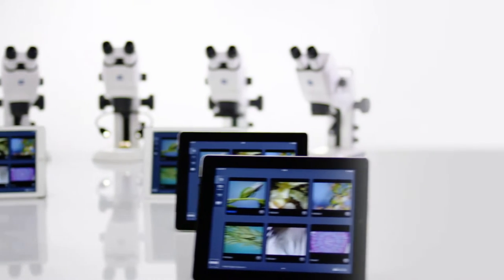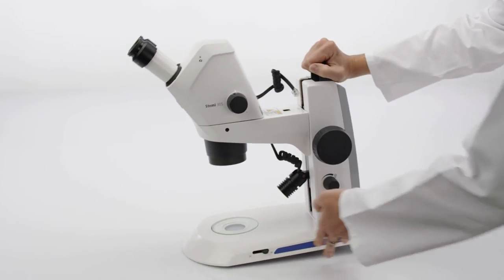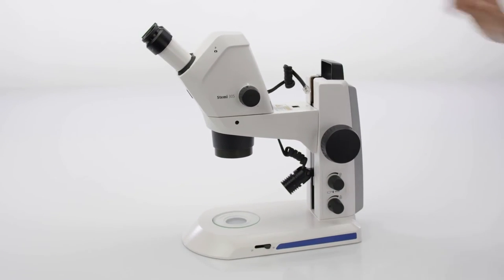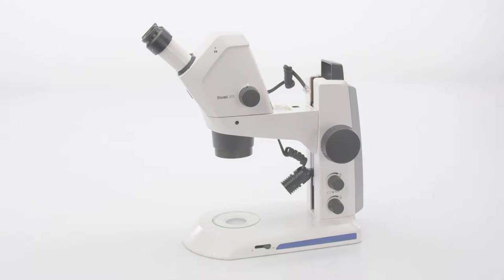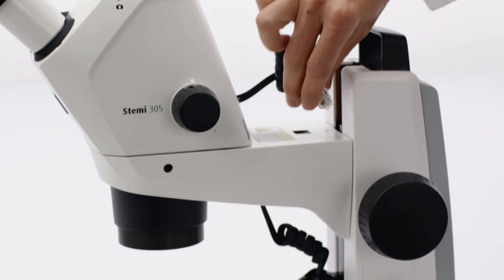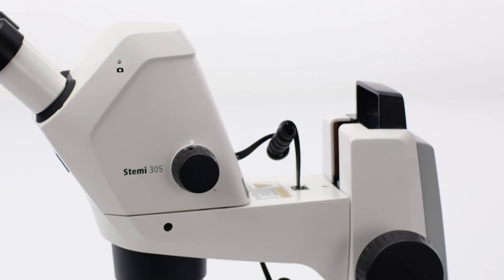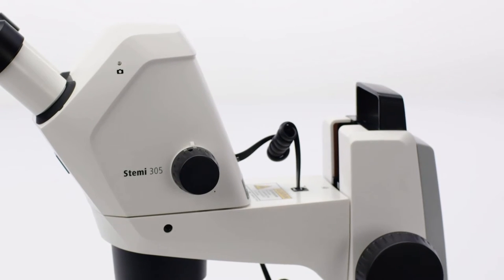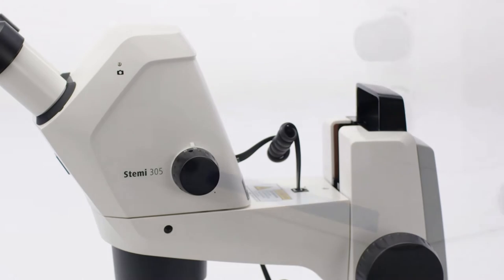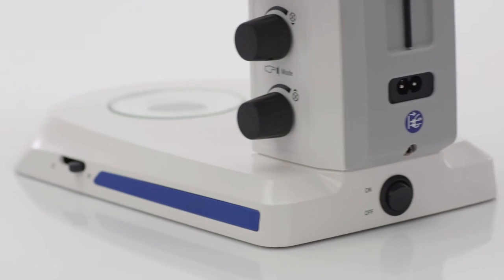Here's how it works. Place your microscope on a level, stable desk. Make sure the spiral cable between the microscope body and stand is properly connected.